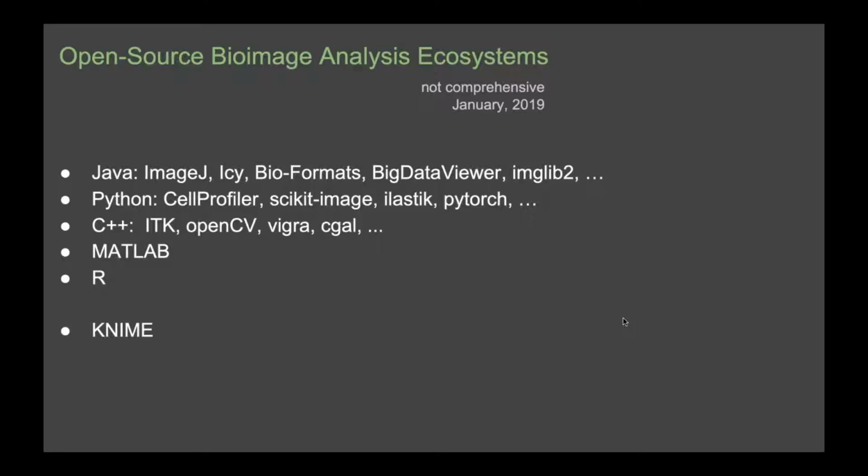Now, in terms of what you can actually use to do bioimage analysis, I tried to make a list here. The first thing you see is that the slide is rather full, and that has both good and bad. The good thing is that in basically all major programming languages, you have something. So you will for sure find a solution to your problem. The kind of bad news is that it's very difficult to actually know which of them to use. Even for myself, I'm now quite many years in this business, I find this very confusing to choose any of these tools. And that is, I think, really just how it is. I don't have a good answer here.